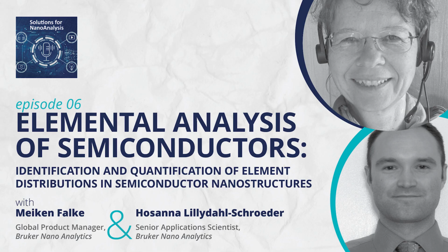And then you have all these strange materials mixed and deposited or somehow manufactured into very thin functional layers. And then these thin layers, they sit on top of each other to build, for instance, thin resistors or diffusion barriers or interconnects. And then it's important to see, are they where they are supposed to be? What happens at the interface of these structures? Are there any failures? And that is where EDS is a really powerful tool.